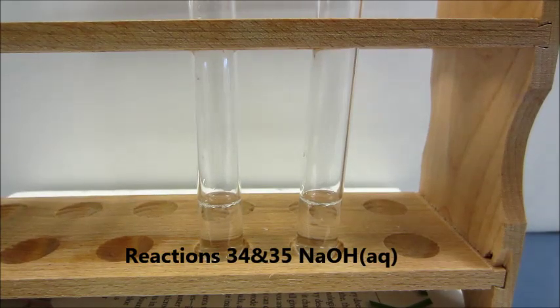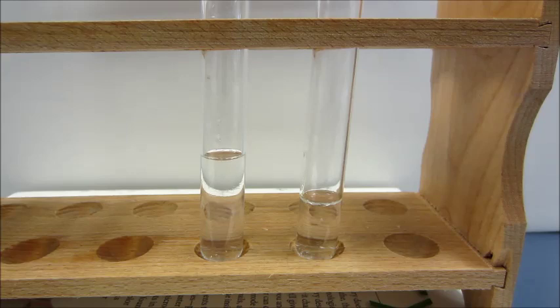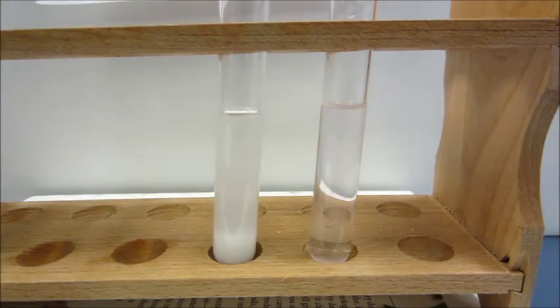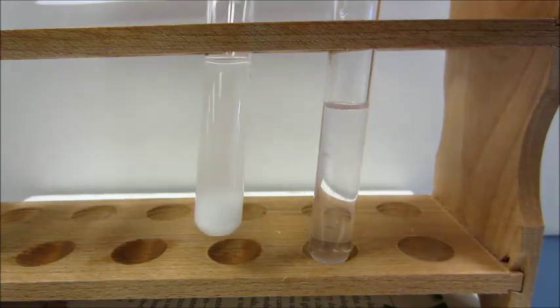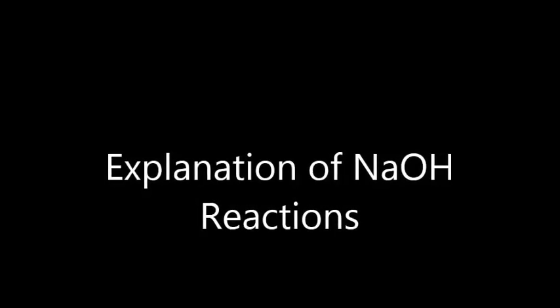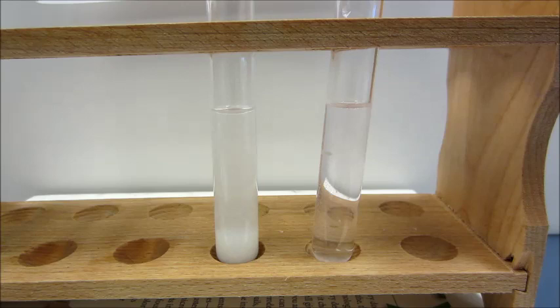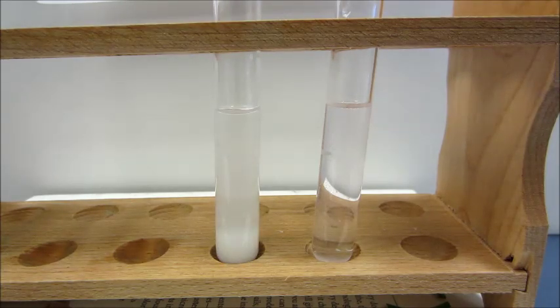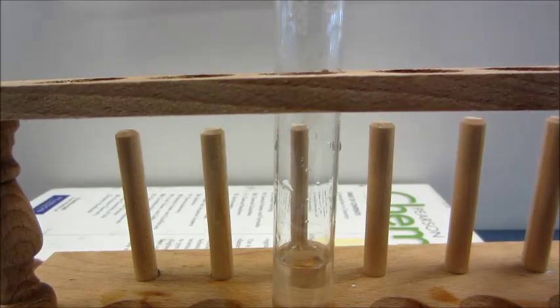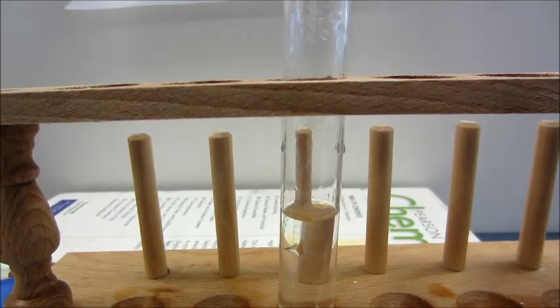Now we have our two test tubes filled with sodium hydroxide. Let's put in some calcium chloride and some potassium chloride. No evidence of a reaction right now, but let's give it some time. Now we can see that no reaction happened with the potassium chloride, but with the calcium chloride we have a lot of precipitate formed — so definitely a reaction happened there. The reason it reacted with calcium chloride is because it forms calcium hydroxide, and calcium hydroxide is not soluble in water — that's why we see this precipitate form. Our last reaction is calcium chloride with potassium chloride: no reaction, because both are chlorides, so there's no reason to trade — they're both already bonded to chlorine.